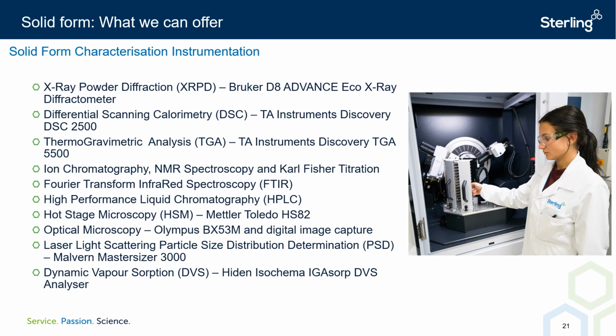We have reviewed why appropriate solid form development is important to ensure the most suitable API version is identified and pursued, but physically how do we characterize an API? What properties do we consider, and how do we examine them when it comes to solid form analysis? In solid form characterization, multiple instruments can be utilized to assess the various properties. First and foremost is API version determination. Which API polymorphic form, salt, co-crystal, solvate or hydrate have we isolated?